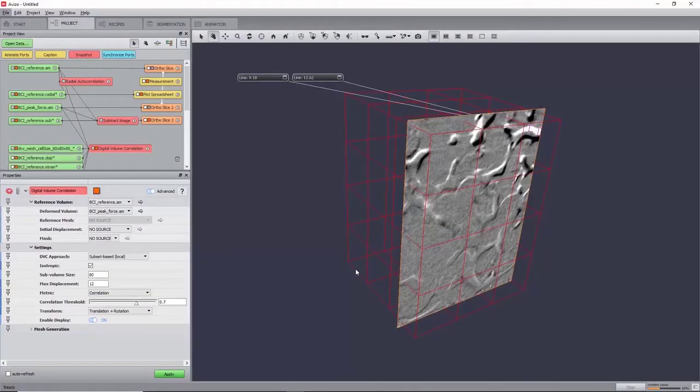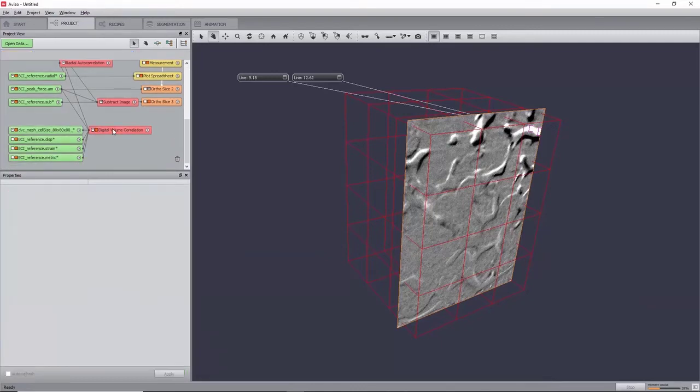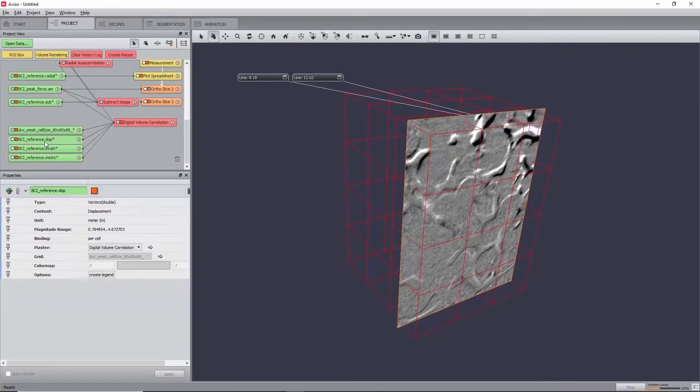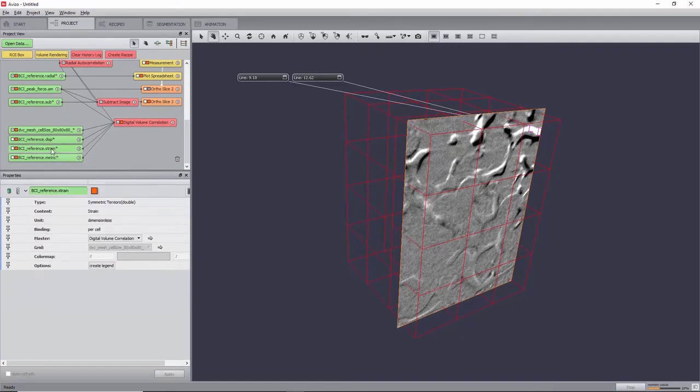Once completed, four new fields will be created. Firstly, a mesh representing the subset, then a displacement field, and a strain field, which respectively store a vector and a strain tensor at the center of each subset.